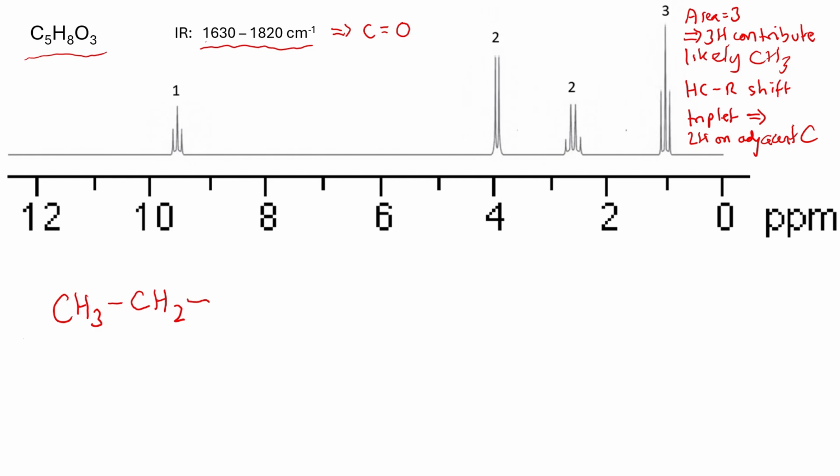So we've now done everything we can about this peak. So let's say we've dealt with that one, so that we don't get confused and come back and think we've still got that peak to worry about. So we'll cross that peak off, and on our growing structure, we'll say these 3 give you the peak at 1.0 ppm. So that comes from that set of 3 hydrogens.